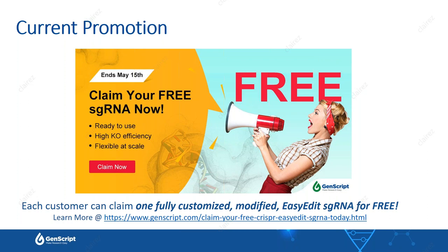Another question, I think this can be our last one since the time is up. Could the RNP system be applied in mosquitoes? For example, are there genes associated with insecticide resistance? That's an excellent question. I'm sure it could be. I am not familiar with mosquito molecular biology, if I'm being honest. Claire, do you have any input on this? I haven't really done insects. I'm sure you can. It's just more the design of the Cas9 or also the gRNA may need to be optimized for that species. Theoretically, I think it is definitely doable.